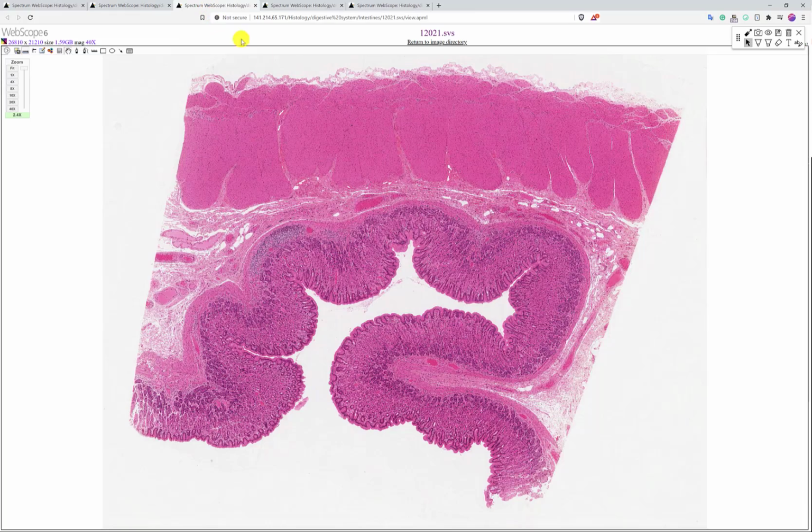The third thing you need to know is the stomach. And for the stomach, I will show you first the layers of the alimentary canal. So here we have the mucosa, here we have the submucosa, and remember in the stomach we have three layers of muscles.